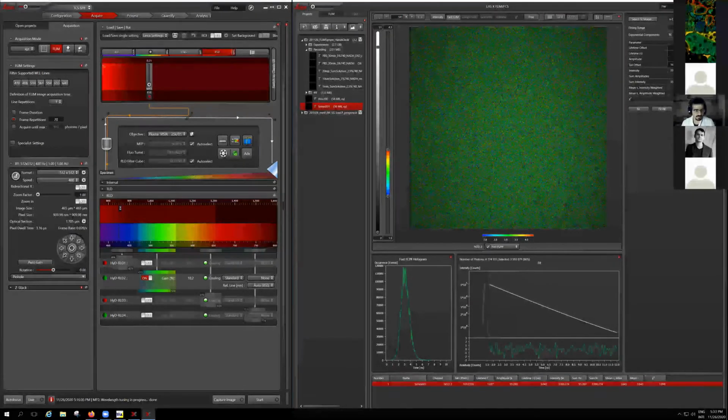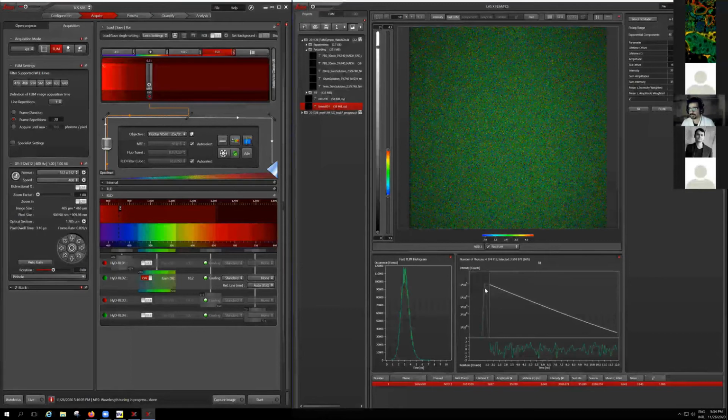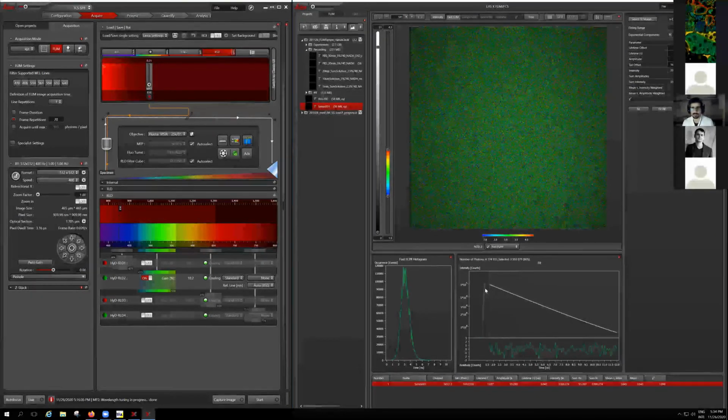What I get here now is there is some contribution, either of the IRF of the system here today, because today specifically our air conditioning is super active. Usually when it's super loud, it's because it's trying to compensate the humidity inside the room in relation to the outside. So it's trying to keep the humidity fixed, stable. And I think that we have this humidity issue as well. So that's maybe the effect, I'm not really sure, why I couldn't get the proper value.